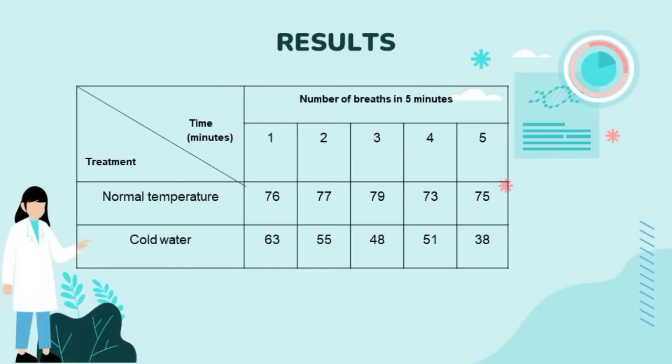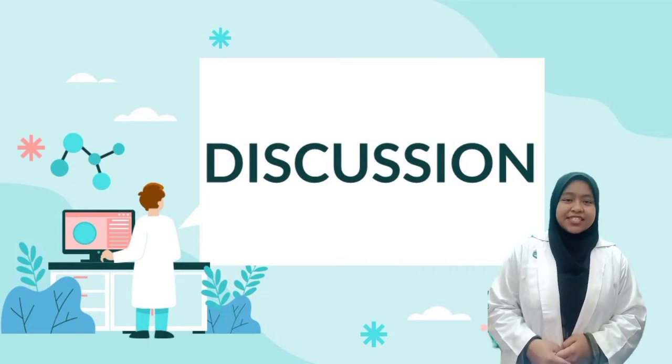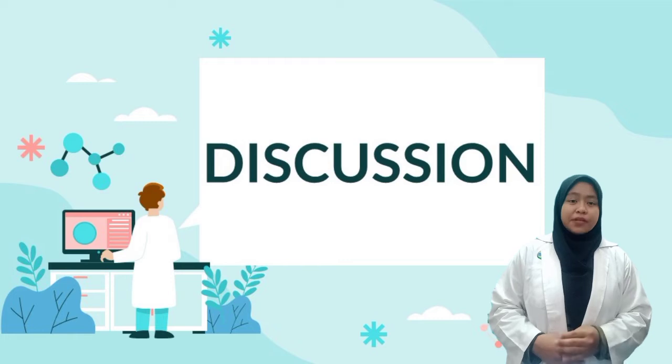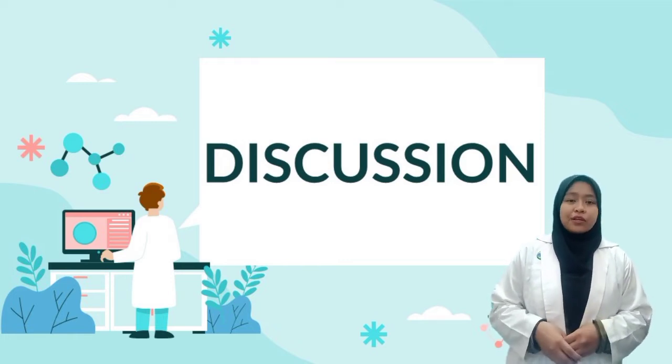So this is the result for the experiment that has been carried out. I found that my data supported my hypothesis. It is true that when the fish are put in warmer water, their breathing speeds up, and when fish are put in cooler water, their breathing slows down.